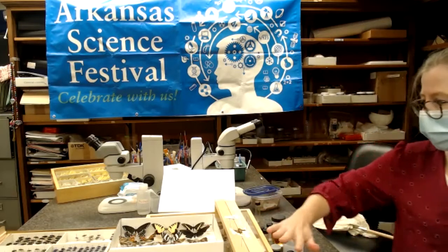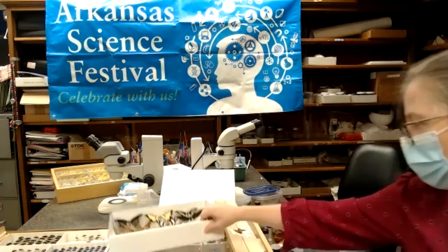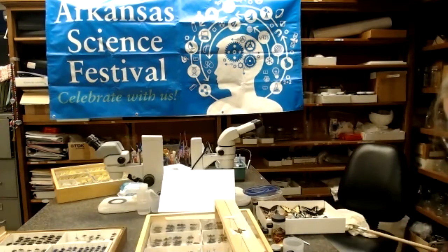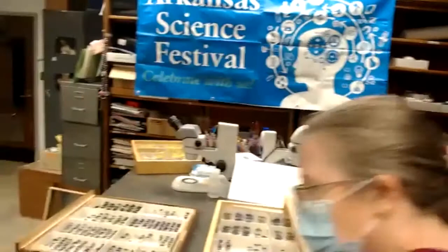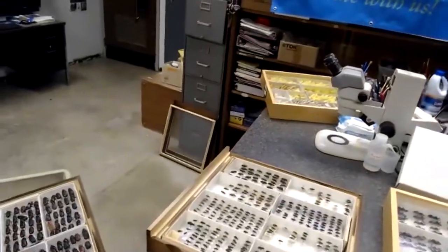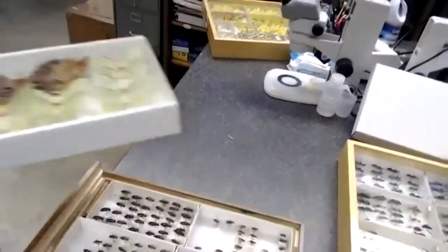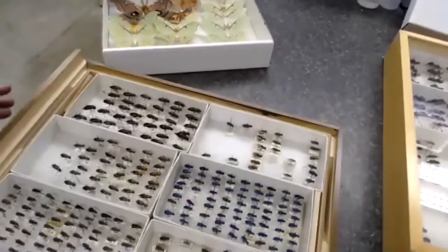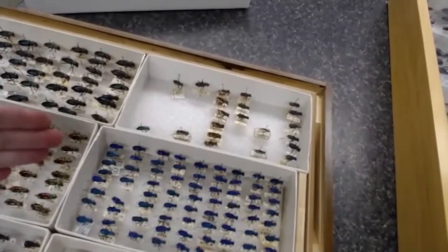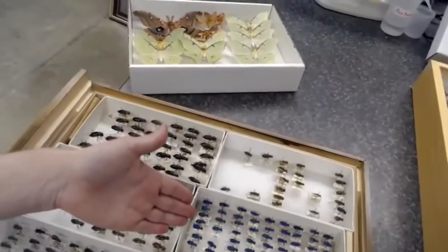So moving forth into the direction over here, we have a number of other insects. So we have quite a few specimens that we've collected over the years. And our insect collection has about 80,000 specimens. And here you can see some beautiful beetles. These are tiger beetles that we've collected. Some tiger beetles have a bluish color to them. That's actually the color that you do see on the specimen.